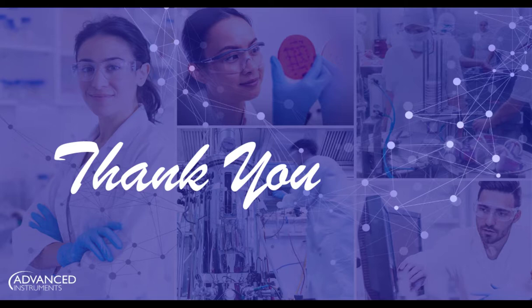And then this would be great, because you already have the UV data and so on, and you could try to establish a simple mathematical model. And later on, you can include more and more online and at-line sensors. And what we have done, and was the surprise, is that the osmolality, which we used as an at-line sensor, works quite fast and gave us very promising results.